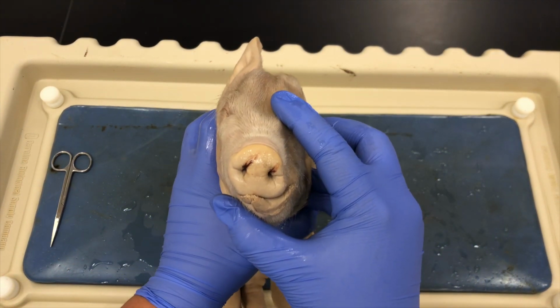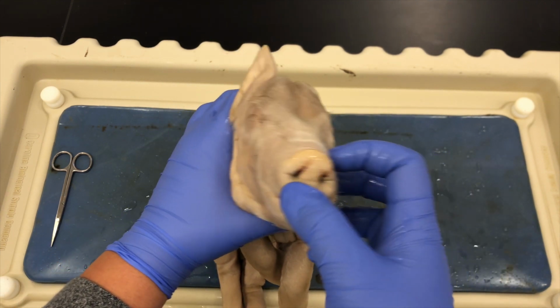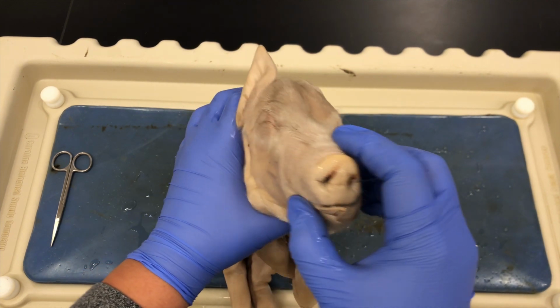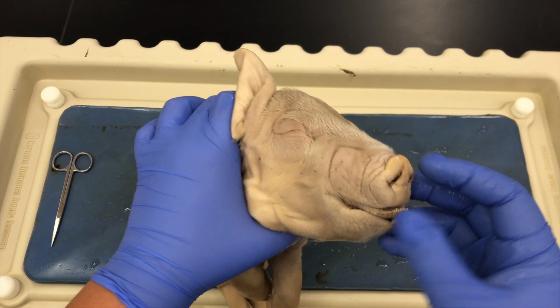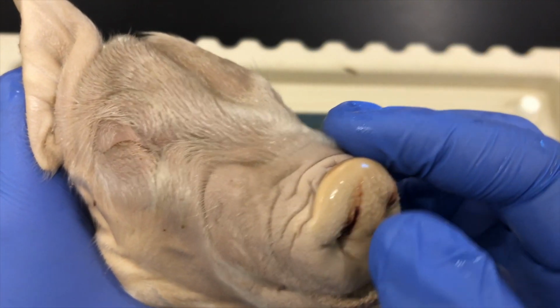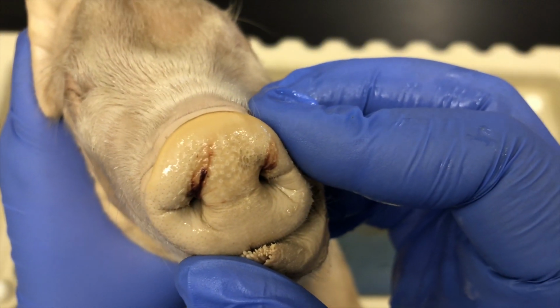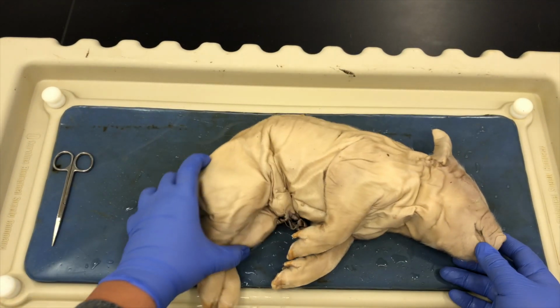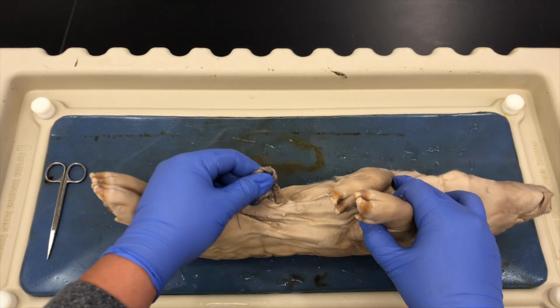here we can see the snout and external nares. Here are the nares. There's the first one and the second one. And here we have the snout. Here we can also see the vibrissae. And here I am trying to get it a little closer and more into focus so that you can see the vibrissae. They are short hairs on the snout. Lastly, we can see the umbilical cord.